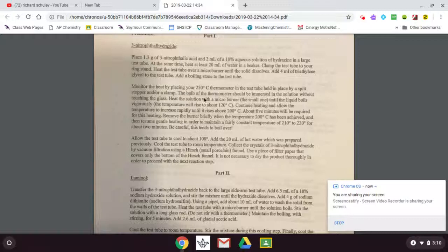And you're going to have to use a 250 degree thermometer. They're special thermometers. I've got them in the back room. And remember for me to get those out, because the reds only go to about 150. So we need a special high temperature thermometer.